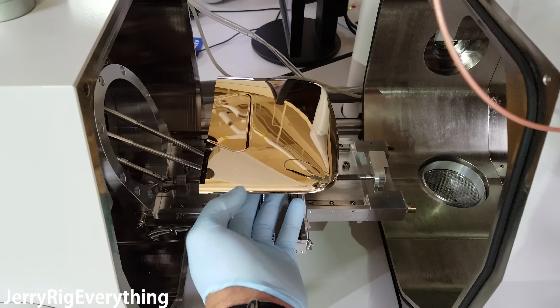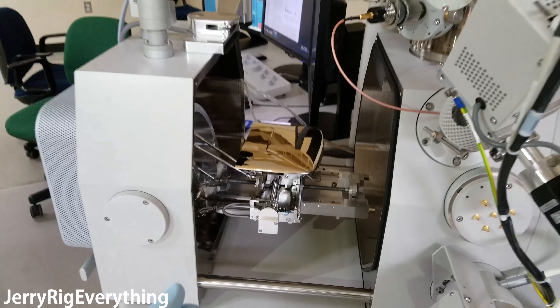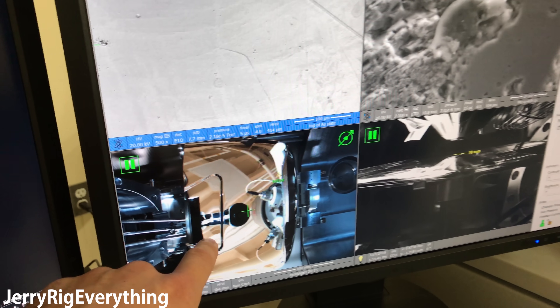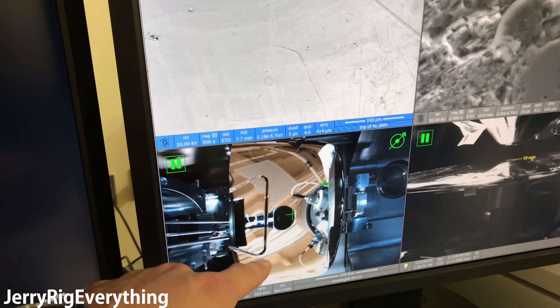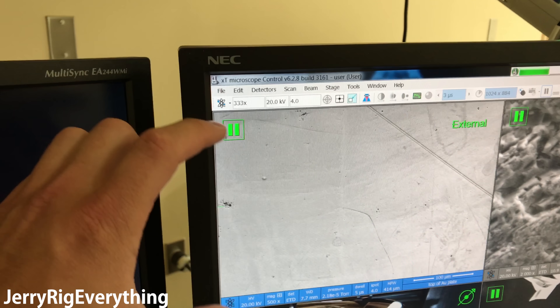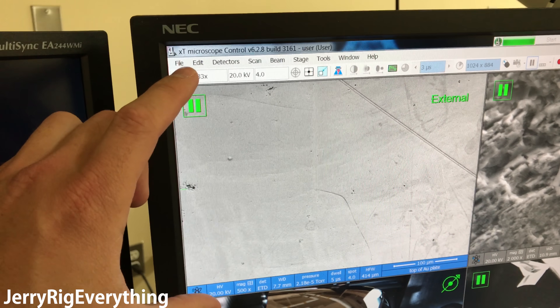Let's put it in here and we are good to go. Your play button is now inside the machine. There's no turning back — this is legit. Inside this machine there's a vacuum sucking all of the air out because an electron microscope can't work in normal air. There needs to be zero air for it to function. This is a live feed from cameras inside the machine — top down, side profile, and a zoomed-in shot of the play button itself.